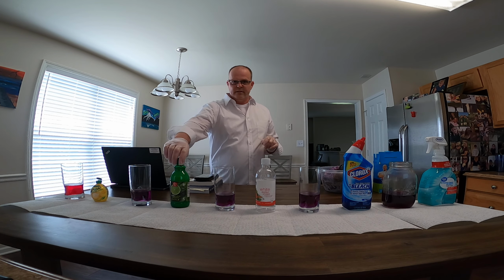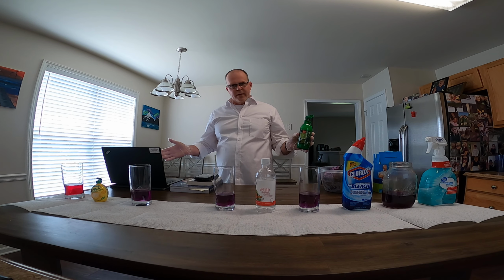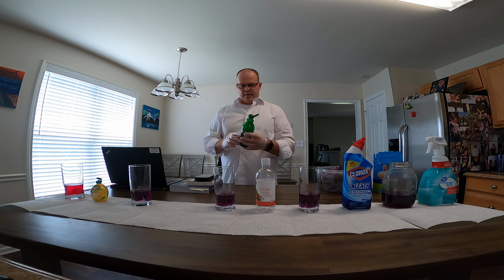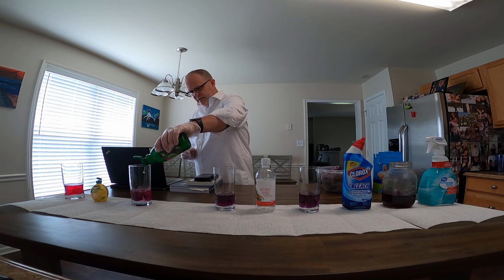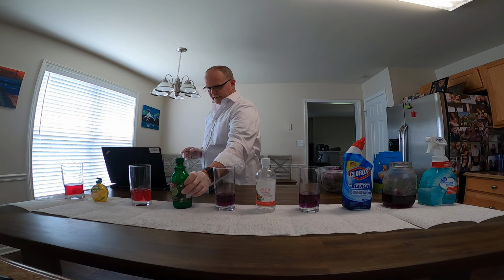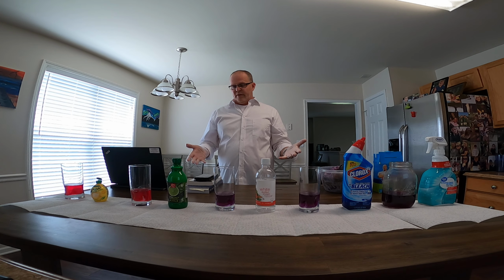Next is the lime juice, and we would suspect that the lime juice is going to have the same effect that the lemon juice did because they're similar acidic fruits. All right. So there again, we have the same effect.